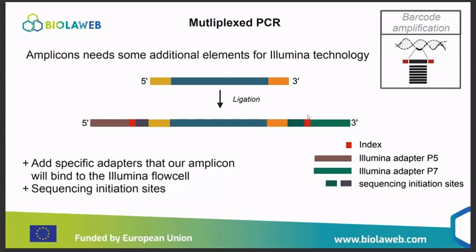You will have your samples separated by your index, and you will work with each data set, one data set per sample, and really it's very straightforward to do. So the reason is financial. Otherwise, in the past, we would sequence samples one by one. In this way, we can put them together and send them as one run and pay one run. So 380 samples can be sequenced together for the cost of one run, if I understood.